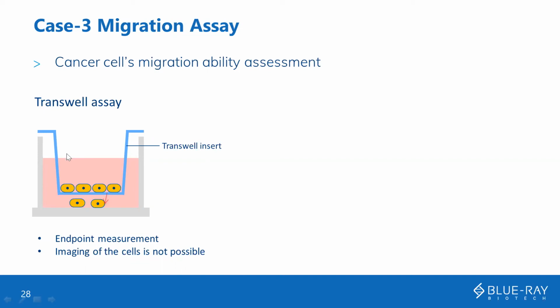There are transwell inserts, you put them in media, and the cells grow inside the transwell inserts. They want to observe whether the cells will pass through the permeable membrane to a lower compartment. And finally, they measure the migration ability of the cells.